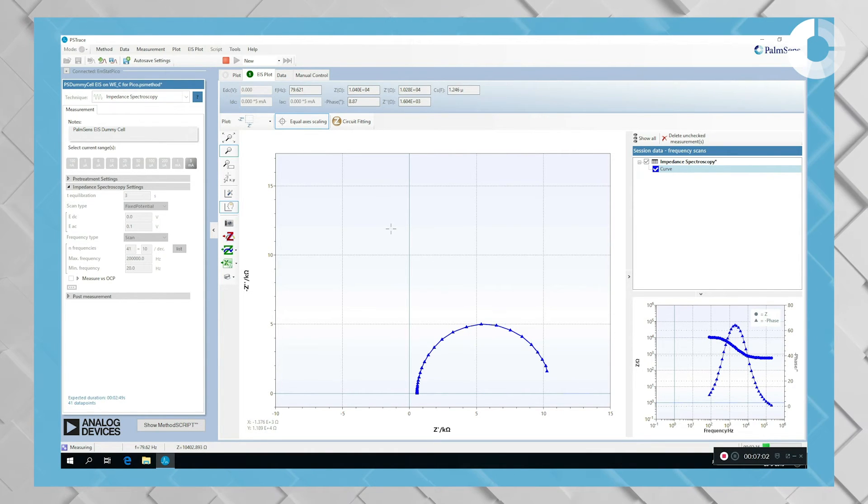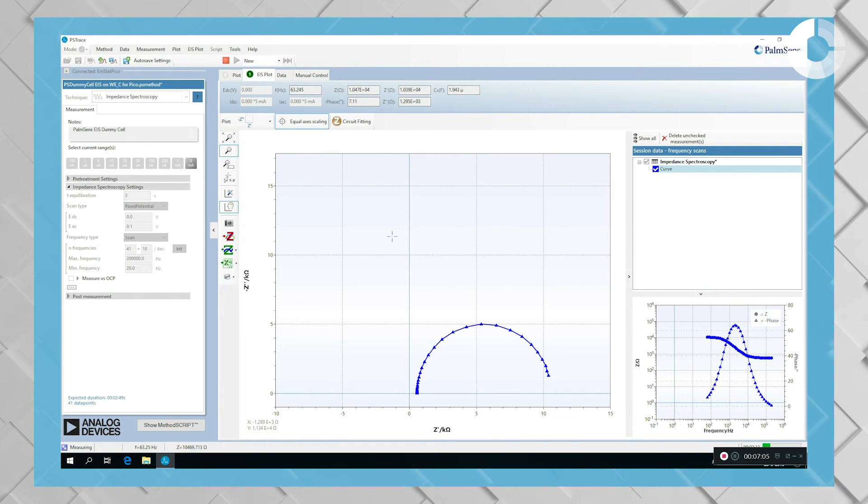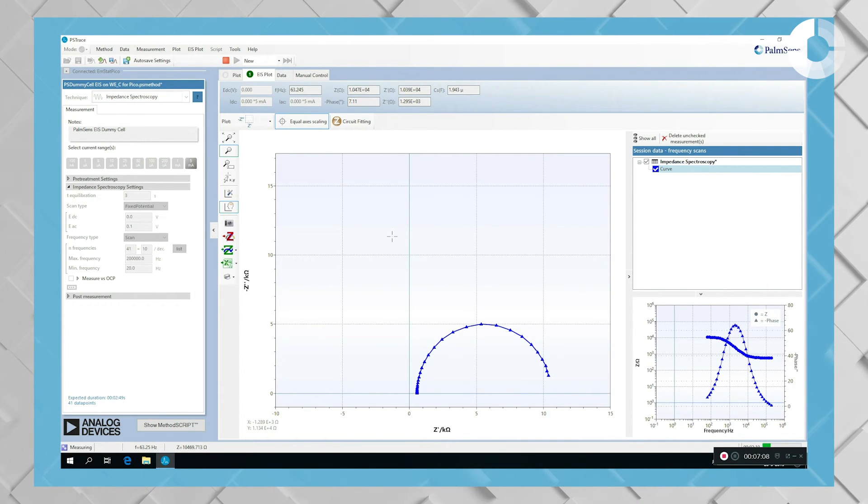To just save some time, we will now skip to the end of the measurement and not wait here in real time.